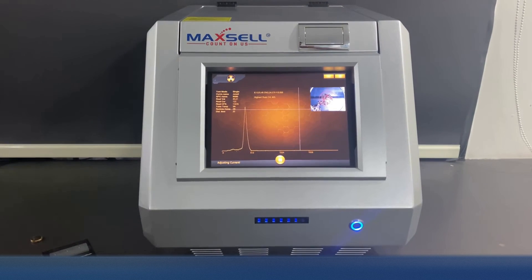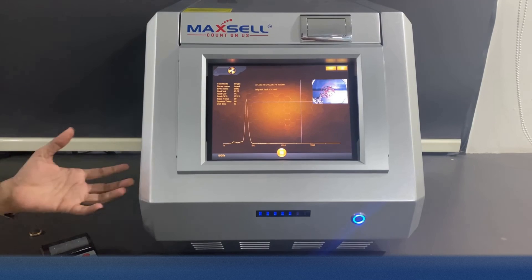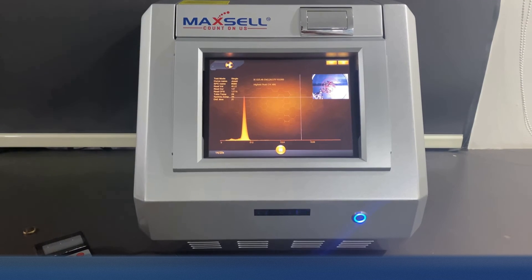This machine is easy to use and the software is so easy to understand that your employees can be trained to use this machine in no time. Maxell Carrot Pro is one of the best in the market to keep your customers and suppliers very happy.